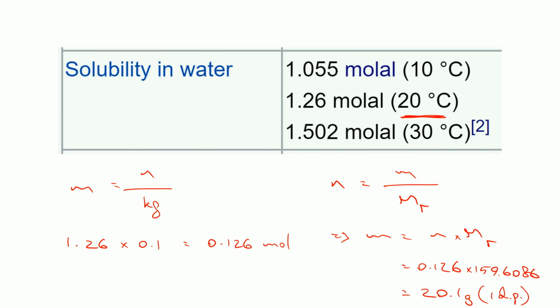100 grams of this solvent, right? So per 100 mils, essentially. 100 mils has a mass of 100 grams. So I'm not actually going to use 100 mils, I'm going to use 75 mils. Okay, now the reason I'm going to do this is simply because if I'd used 100 mils, I'm actually going to divvy it up into 3 test tubes, this solution, and I'm just going to have some stuff left over, which is no real biggie.